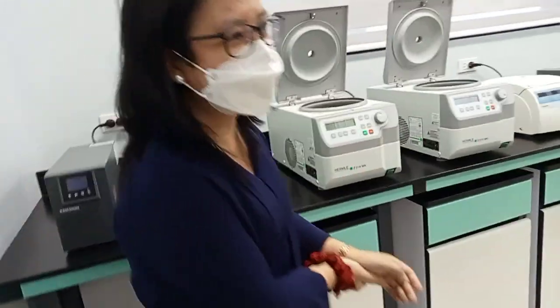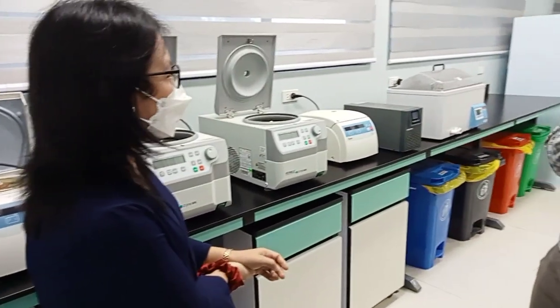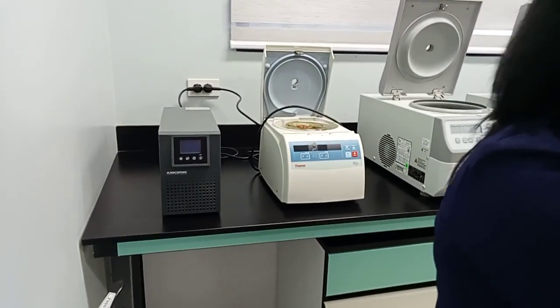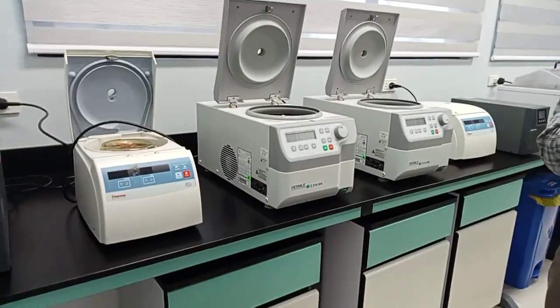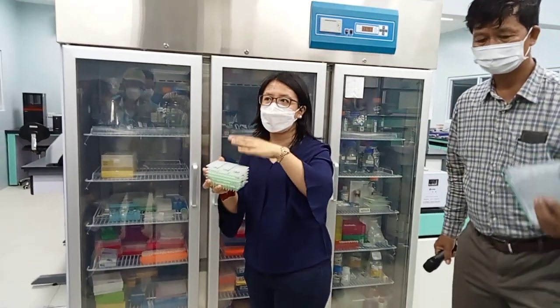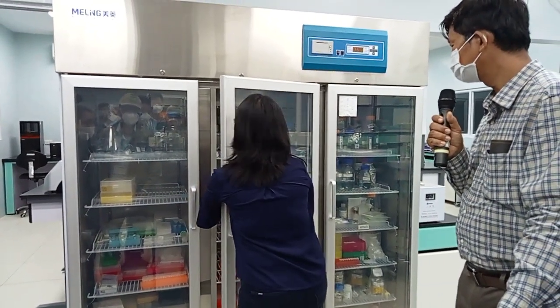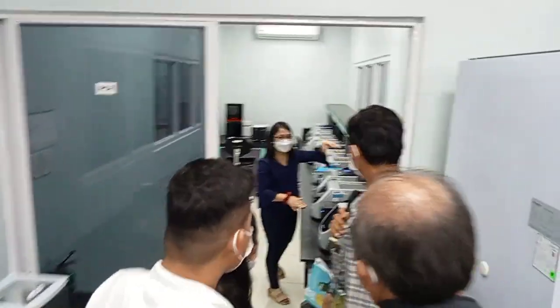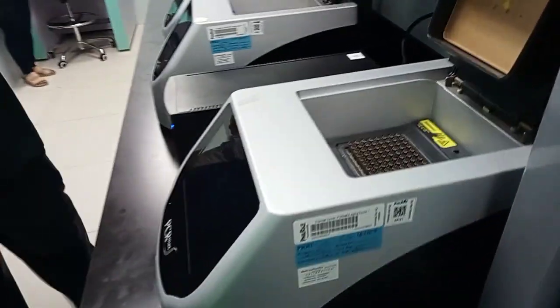So we have a few of our centrifuges. So basically we just use it for our extraction of DNA. Then after extracting DNA, we go to the PCR room wherein we amplify our DNA. So for example, we put our DNA already here. We will use the PCR machine to make copies.